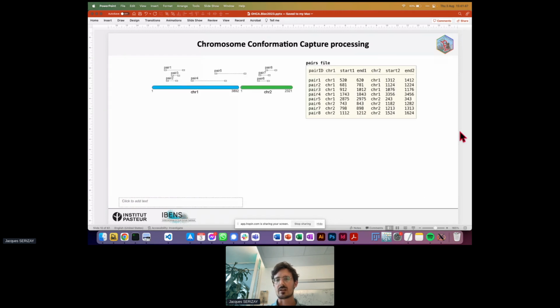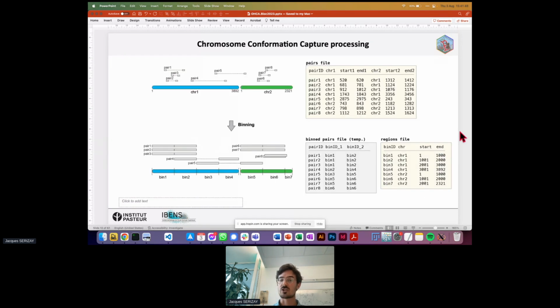Typically, especially on large genomes and longish read sequencing, as in 100 base pair and more, what can be done is first trying to map the first 20 base pairs. Then for the reads that don't map, extend to 40 base pair and then 60 base pair, etc. And I'll mention some tools in a minute when I talk about workflows.